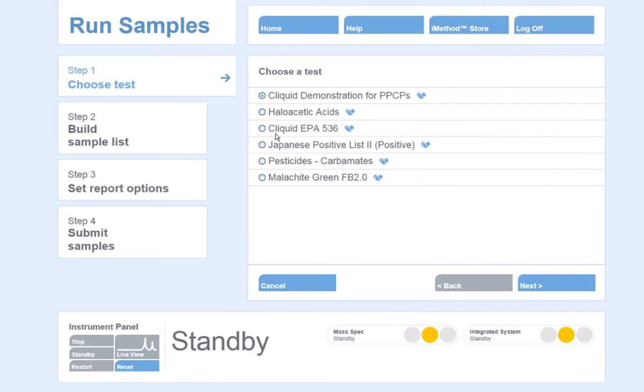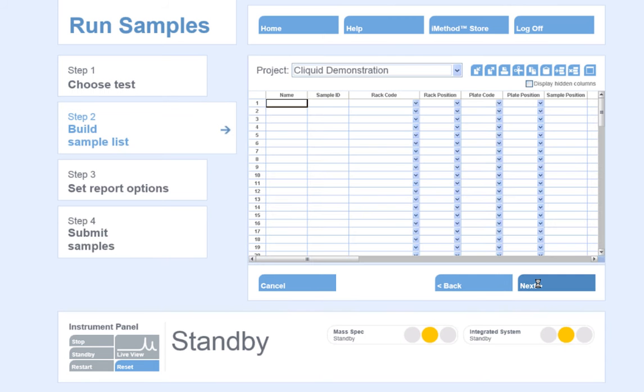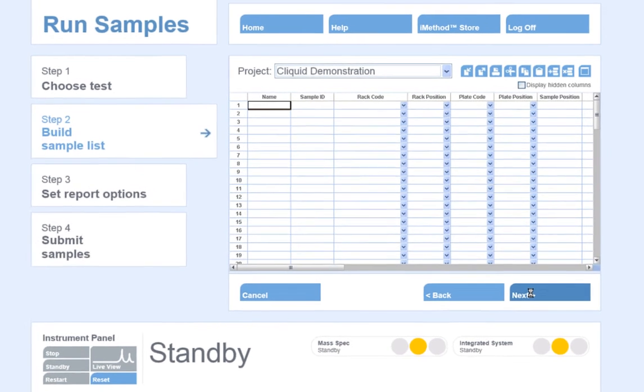Once we select the test to run, we will click Next. The software will guide us into creating a sample batch for submission.